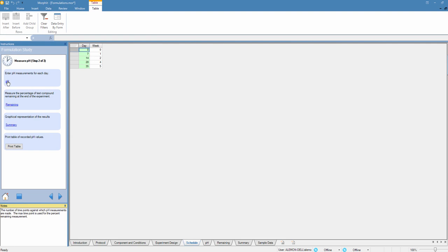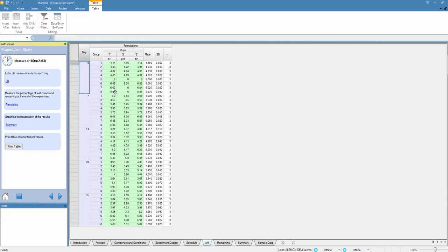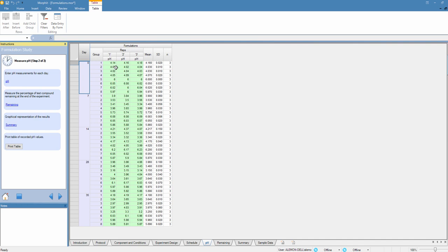First thing we're going to do is measure the pH values. In this case I've prefilled out the table. We can electronically capture the pH data from a pH meter if required. In this case they've been manually entered. So you can see for each one of my study days, my eight different formulations, I'm measuring the pH in the three replicates and calculating the mean and standard deviation across the replicates.